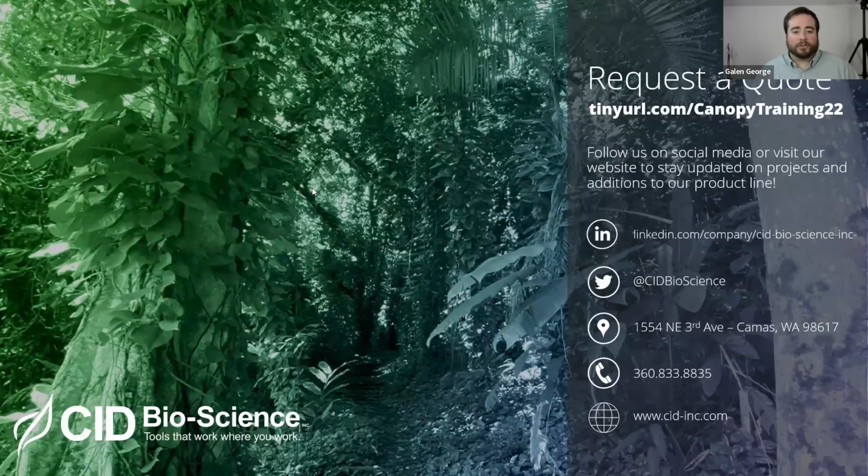But all of the technologies have some difficulties. It is ideal, obviously, to do it in diffuse light situations, but that's not how weather works. It's not always diffuse light. So we try to make sure that everyone has options to use these instruments in all lighting conditions.